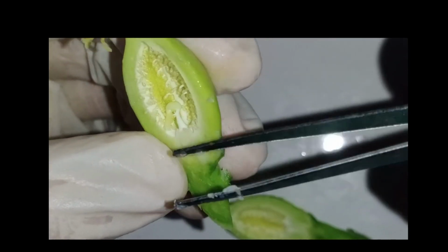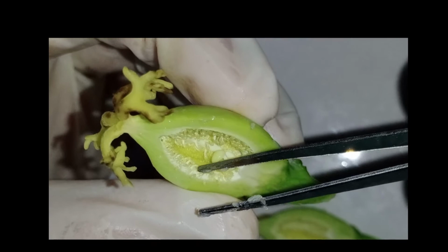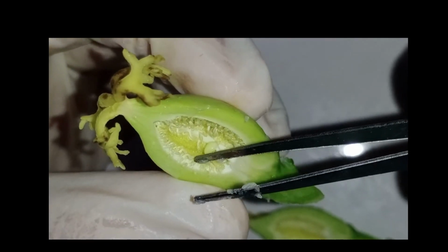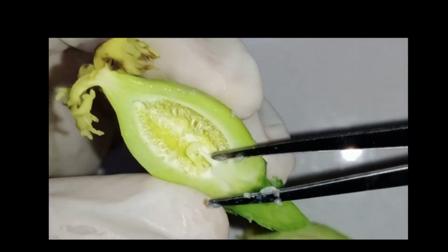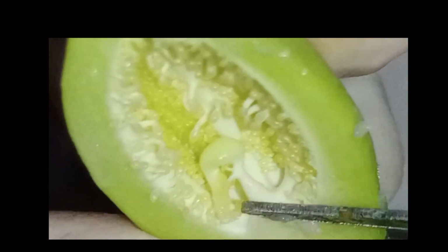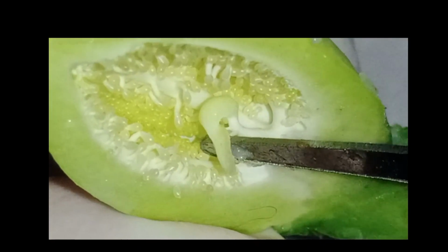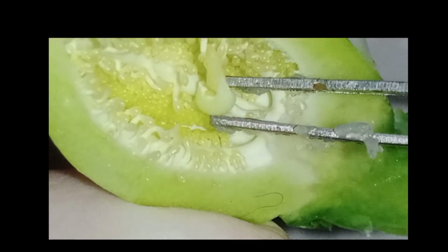The small white structures like this we call the ovule. And here maybe this is the embryo.